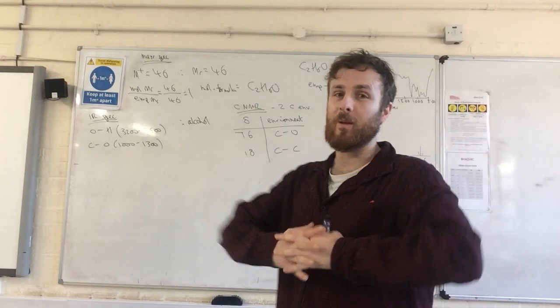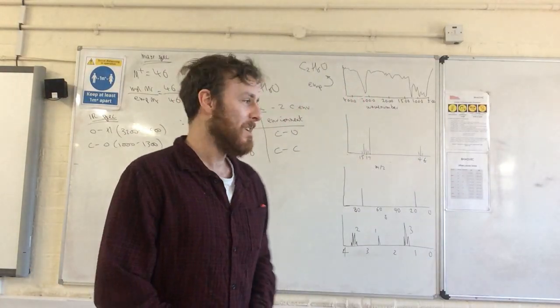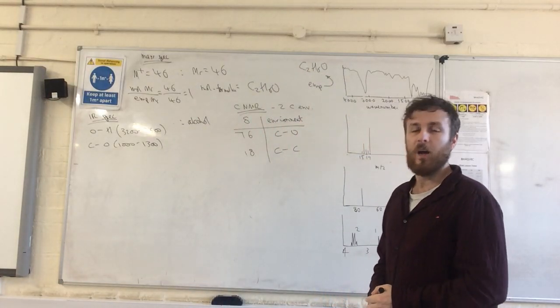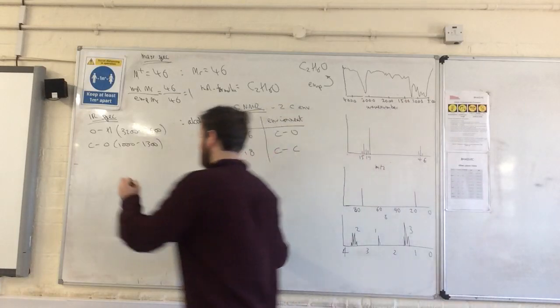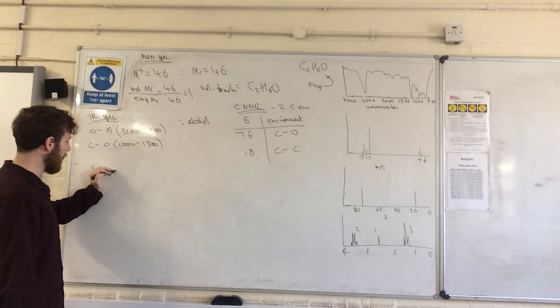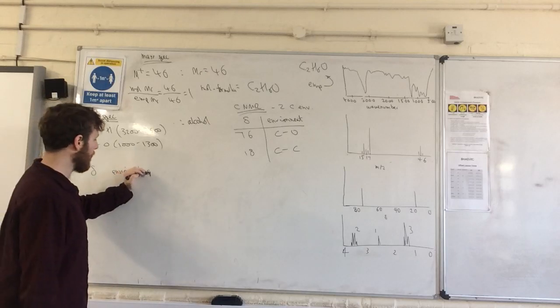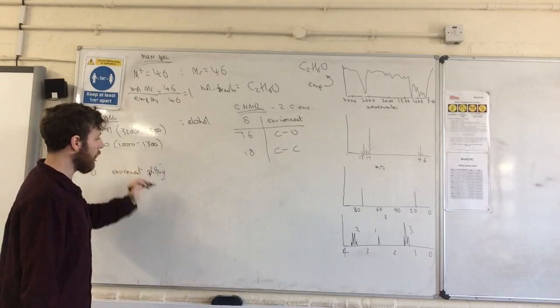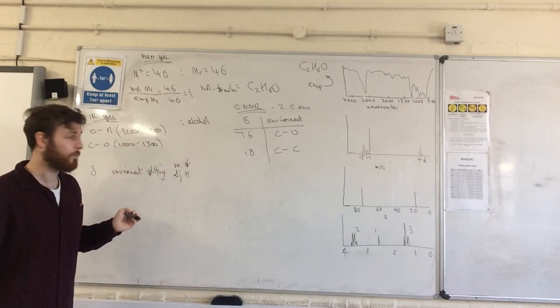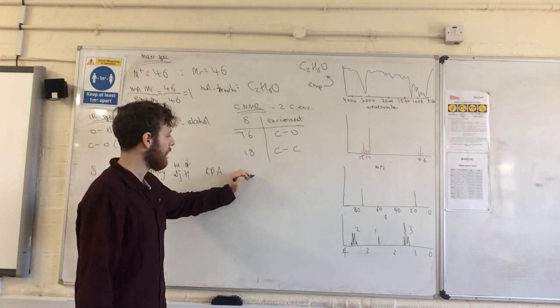Okay, so on to the big boy. I would maybe stop for a minute or two just to give yourself a rest before we get into this, because there's a bit to it. So for the hydrogen NMR, we have a 6-column table. Ooh la la. And they come in pairs. So the chemical shift will tell us the environment. The splitting will tell us the number of adjacent hydrogens, the n+1 rule. And then from the relative peak area, that can tell us the conclusion.